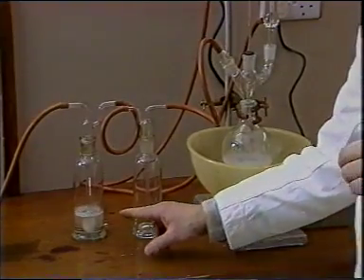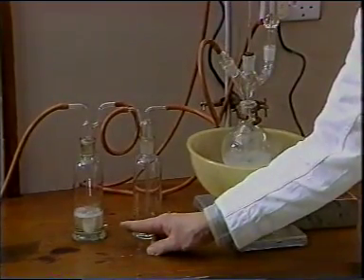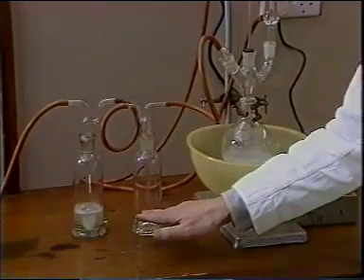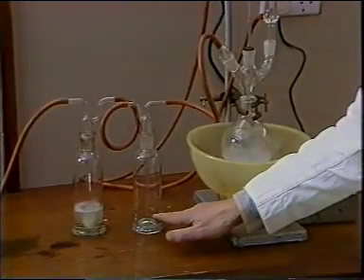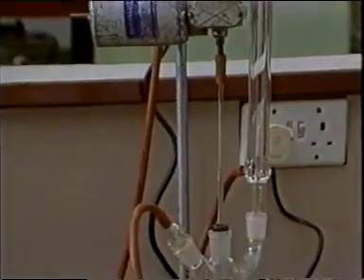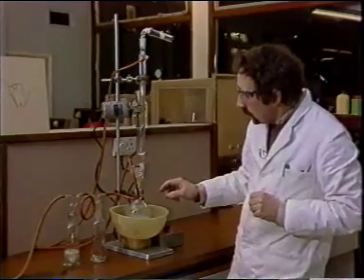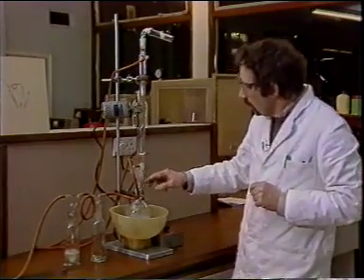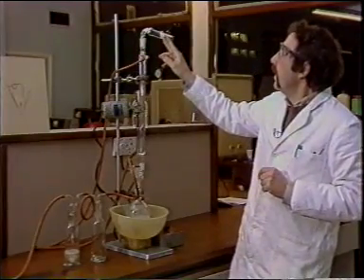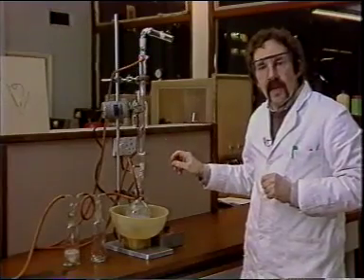Note that we're taking the extra precaution of drying the cylinder nitrogen by passing it through concentrated sulfuric acid. This second bottle is to stop any spray from the acid from passing into our reaction. We use the mechanical stirrer whenever we have solids as well as liquids or solutions involved in our reaction. And we maintain a positive pressure of nitrogen, which is allowed to leak out through the stirrer seal and through this silica gel guard tube without allowing oxygen to enter the reaction.